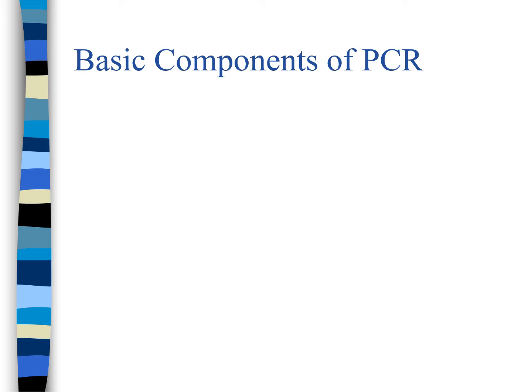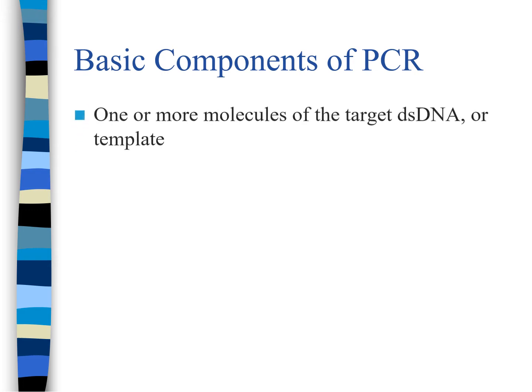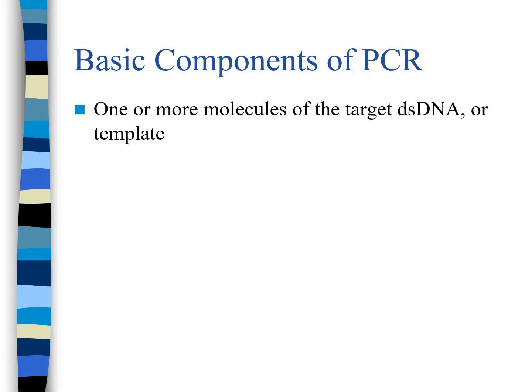To do that, we need to add the different PCR components. The first component is the patient sample. This is the double-stranded DNA that we obtained from last class. We call it the template. We also need primers. Primers are small DNA sequences that we buy from companies, specifying the beginning and the end of where we should amplify the DNA. They are specific to the cancer gene, so they can only amplify the specific gene. They are important for specificity.